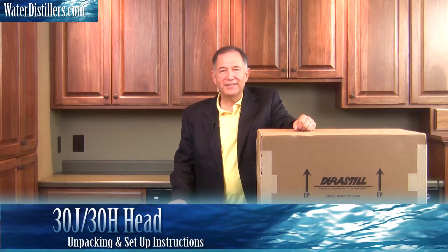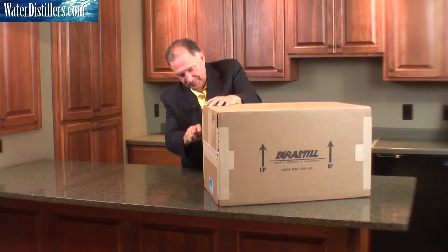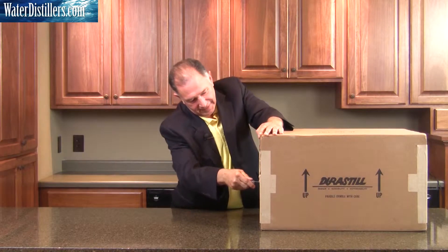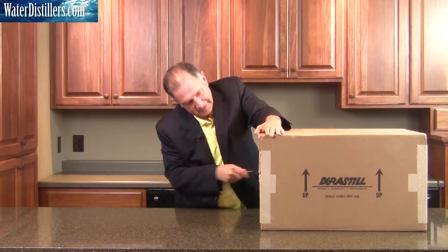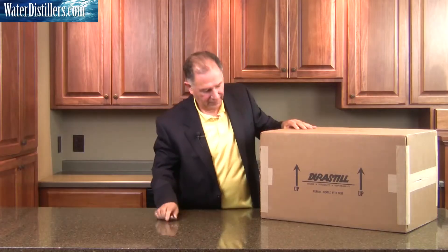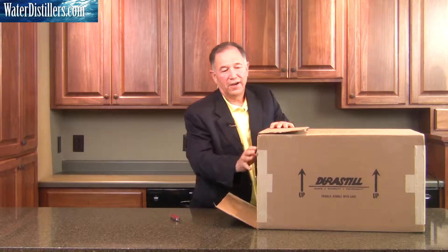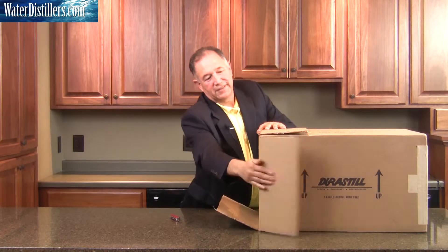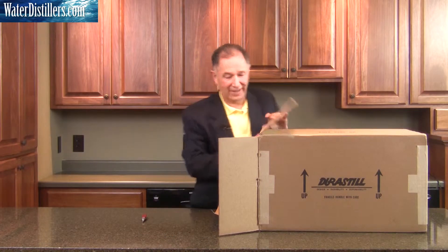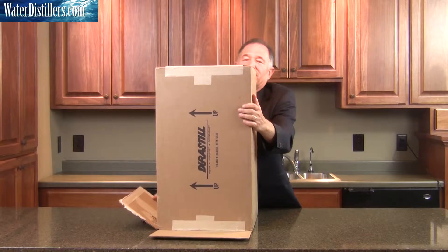On this video, we're going to be unpacking the Durastill 30J. As we unpack it, we open up the flaps fully on all sides because we're going to flip the Durastill over on its side. It's a lot easier to unpack that way — sometimes it's a little tricky, but it's a lot easier.